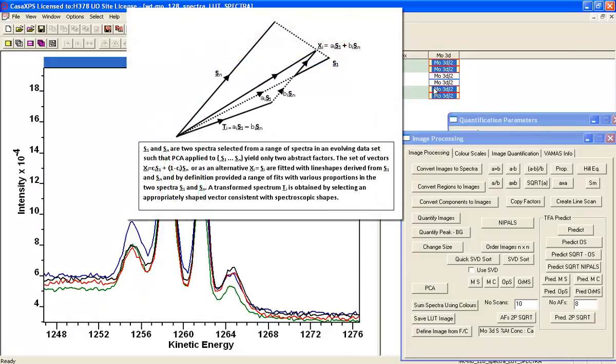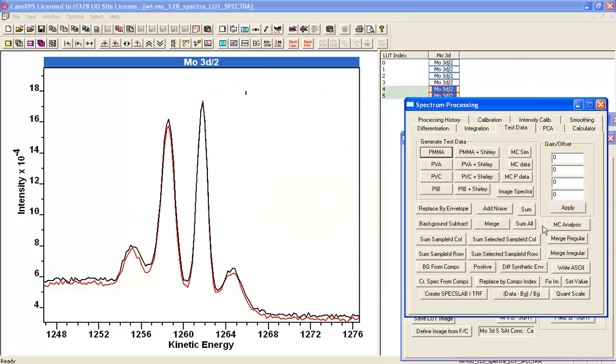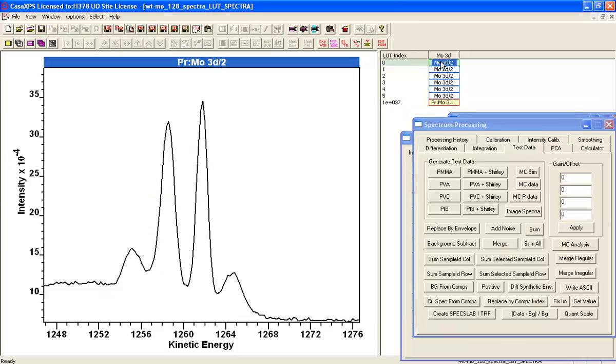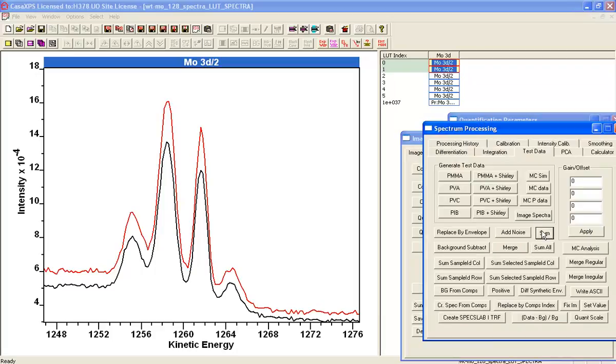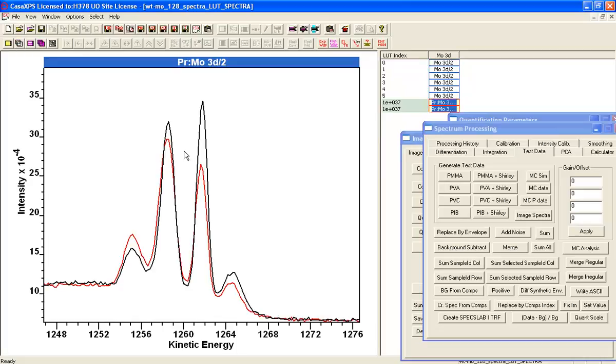So what we'll do is a little bit of analysis based on manipulating these intensities as vectors, and the first thing we'll do is add a couple of these together that we can see make sense in terms of one form and the other. And the idea we're trying to improve is signal to noise. When you do manipulation of these as vectors, noise tends to be amplified, so it's always a good idea to have the best signal to noise that you can achieve with data.